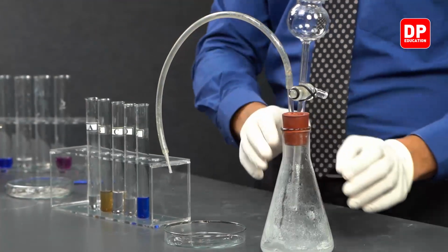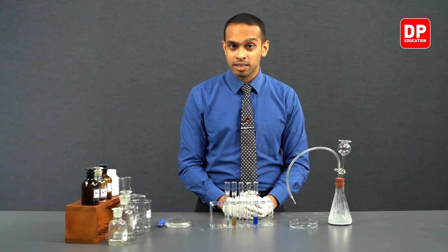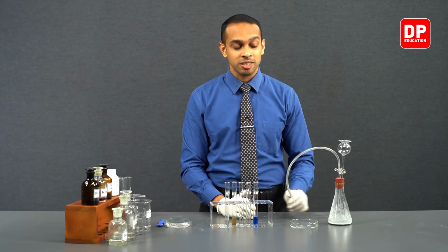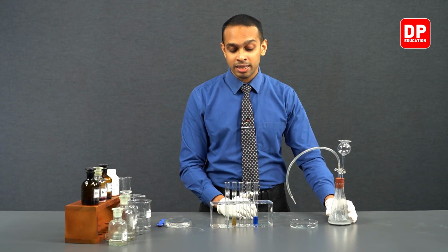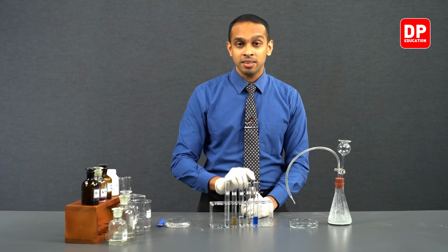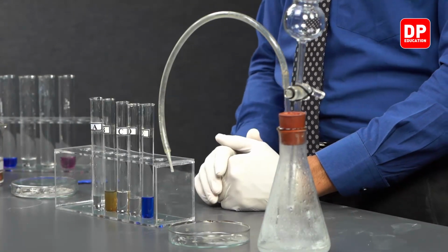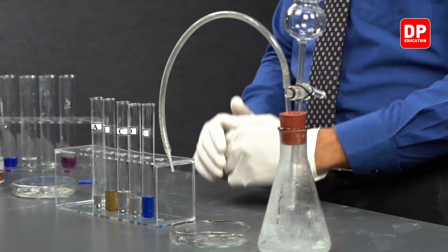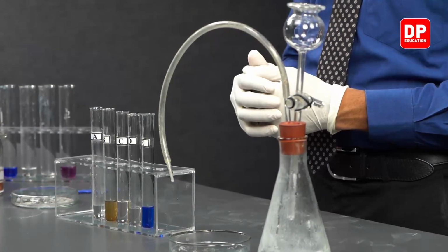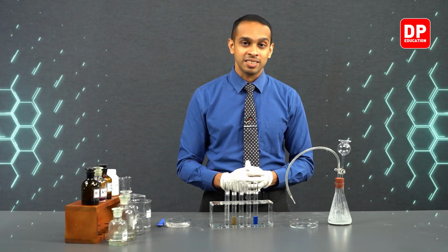Now students, all of the calcium carbide that is in this container has reacted with water. So we are going to add more calcium carbide into this reaction mixture and then send the acetylene gas that is produced through our ammoniacal silver nitrate solution or the Tollens reagent and ammoniacal cuprous chloride solution to observe if there is any color change that is going to take place. So let's move on to adding some calcium carbide and continuing the reaction.